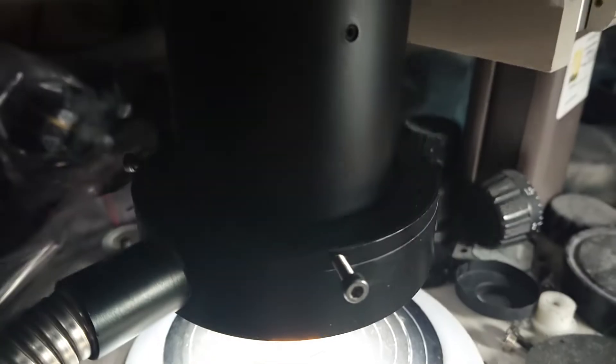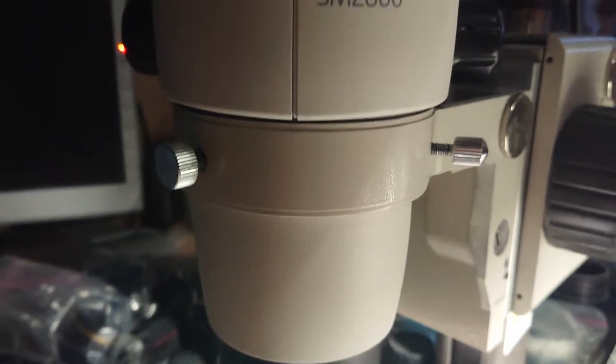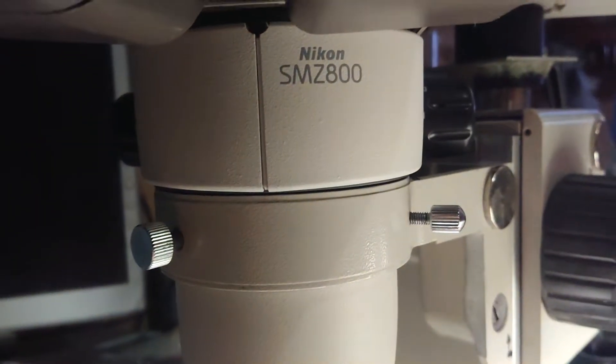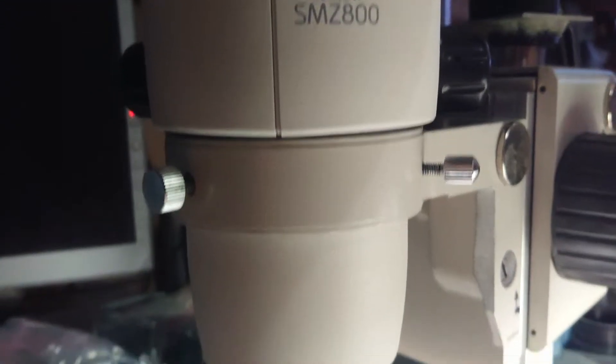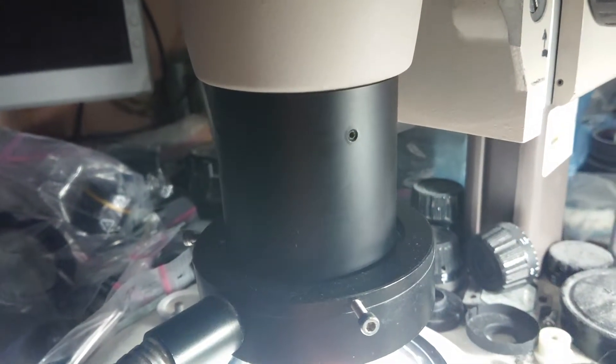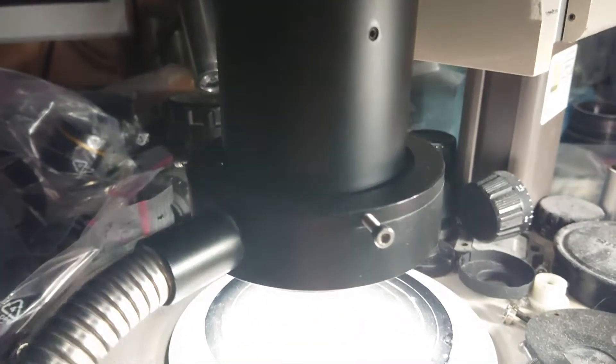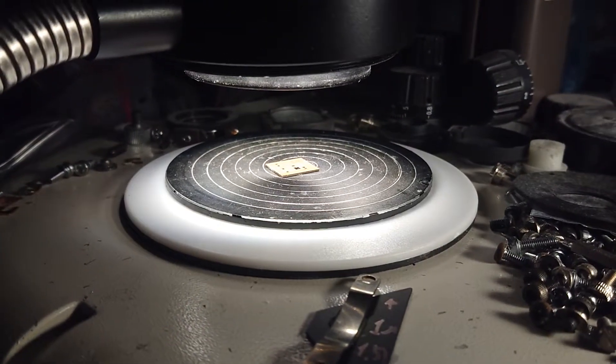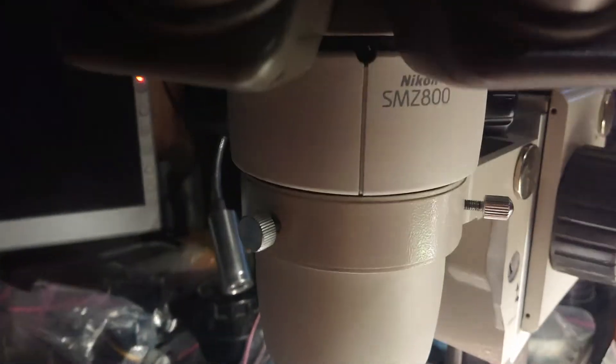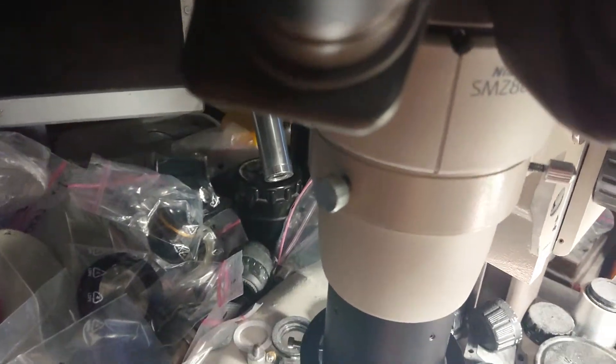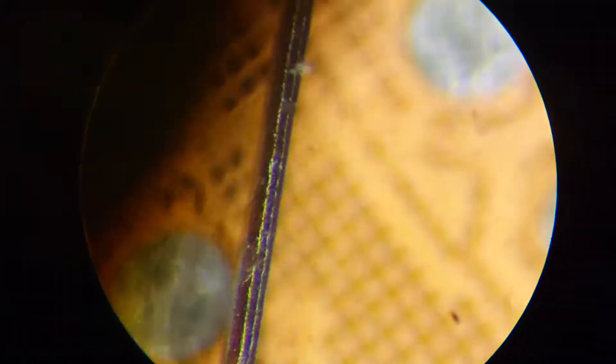But this time we are watching it through the Nikon SMZ800 microscope with Nikon's ED plan 2X objective with a distance of 32 millimeters. Let's try to spot the difference with the previous set.